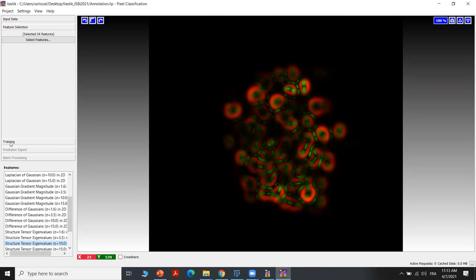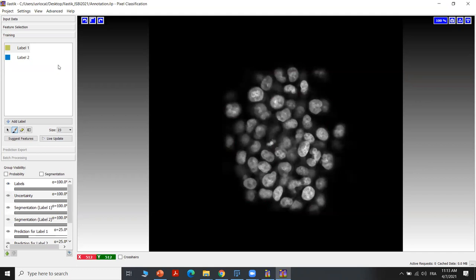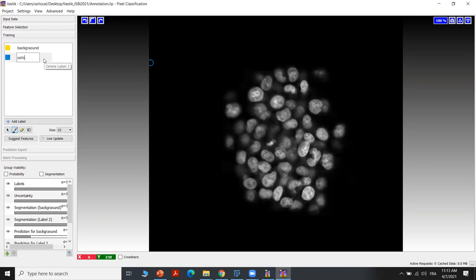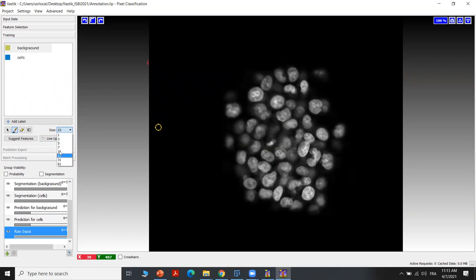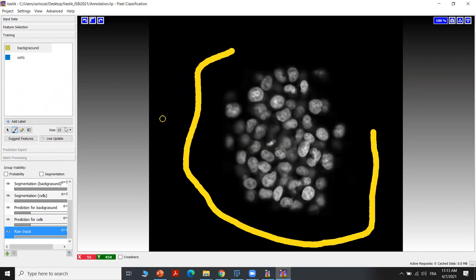Now let's move to the training step where we will start the annotation. The annotation here is very easy — it's like painting and we can just select some regions using the cursor. We have here by default two classes, two labels. Let's select the first one as the background and the second one as cells. We also have the possibility to add more labels by clicking on 'add label'. Here I will use only two classes. You can start annotation by changing the size of your cursor — let's start with a large size for the background, and then choose a small size for the regions between the cells.